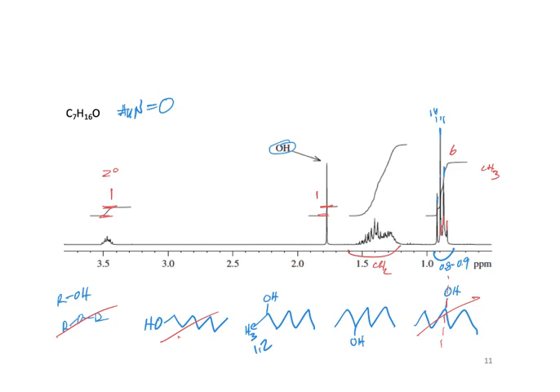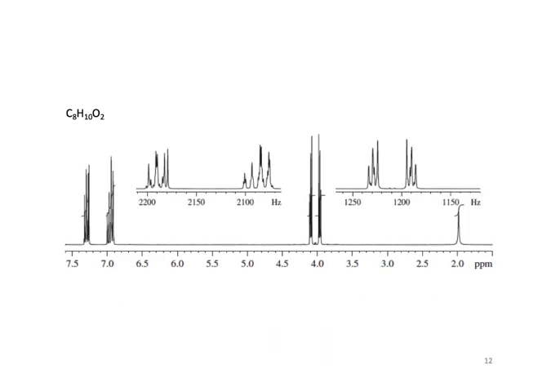You'd have some kind of a doublet over here. So I would agree that this one seems like the better one because the 2 methyl groups would be more similar or more overlapped. That's the main thing, I guess. But yeah, it's a little hard to see because it's real messy in there.